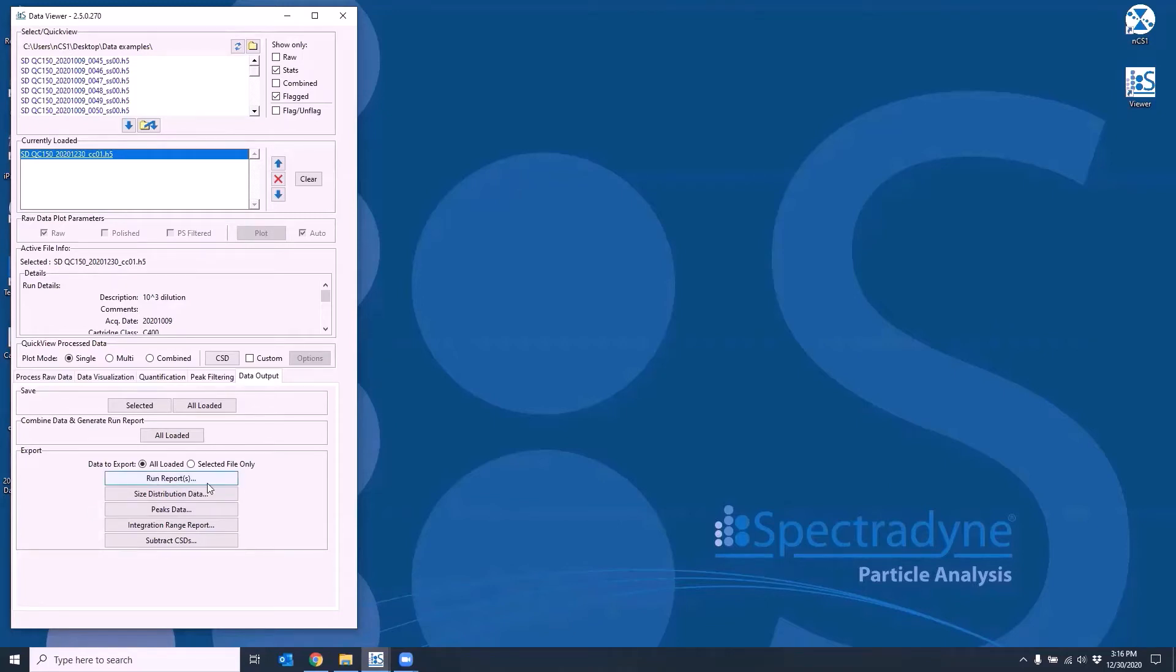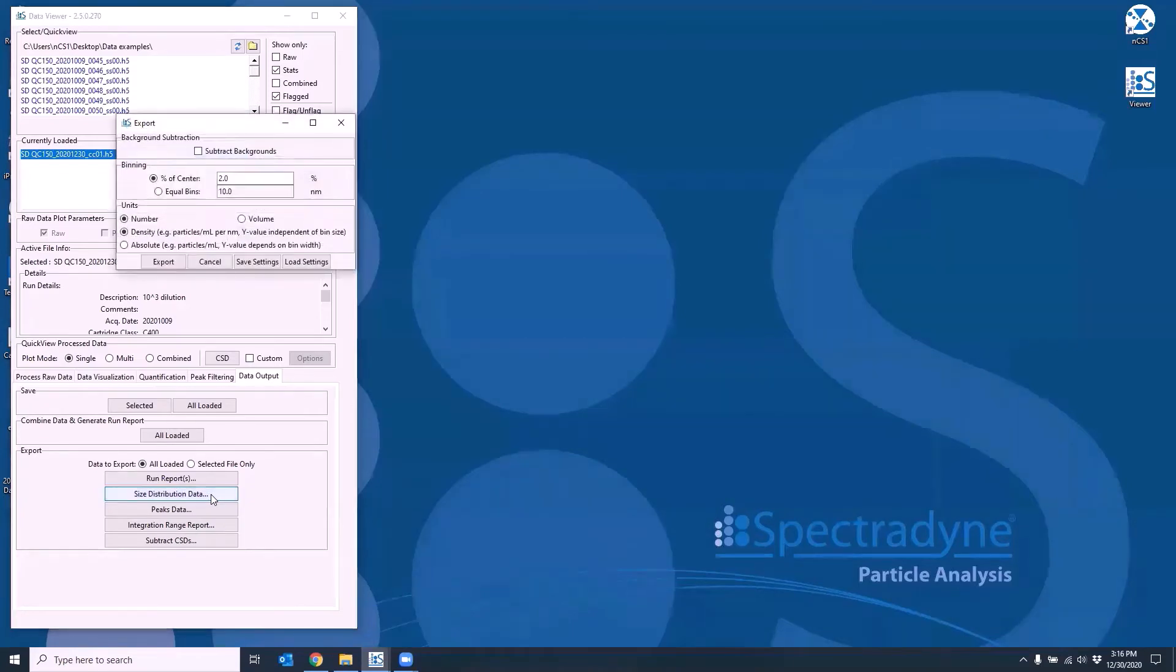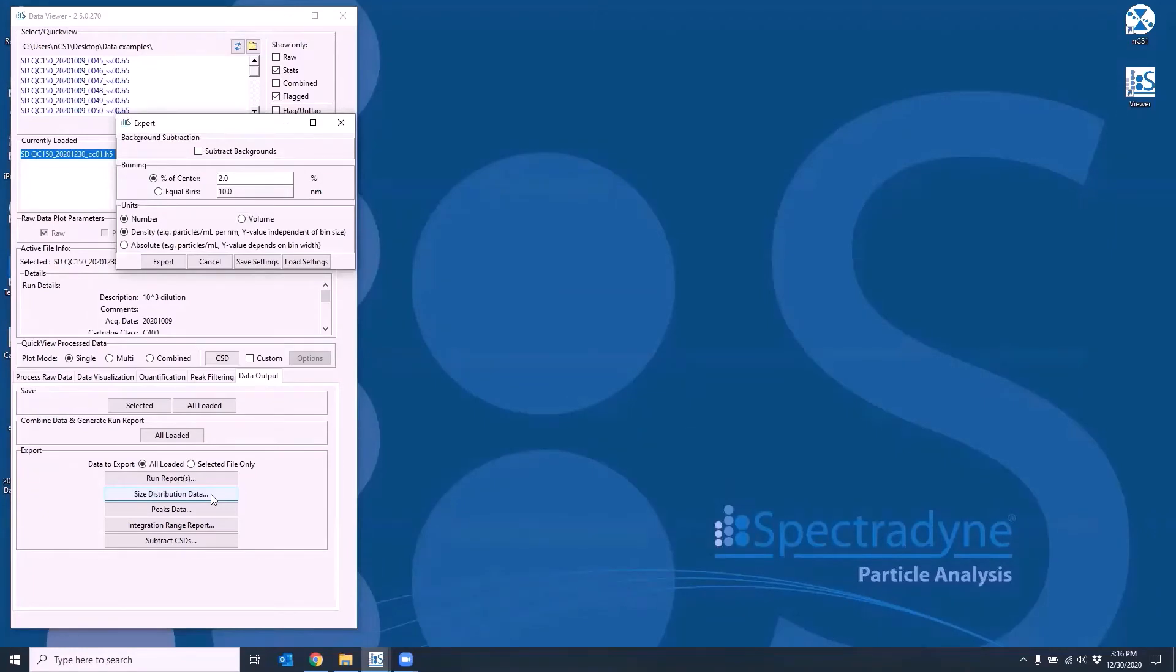The size distribution data export option will allow you to modify the binning for the size distribution, as well as the units in the concentration, whether it's number weighted or volume weighted, as well as density weighted or absolute concentration unit.